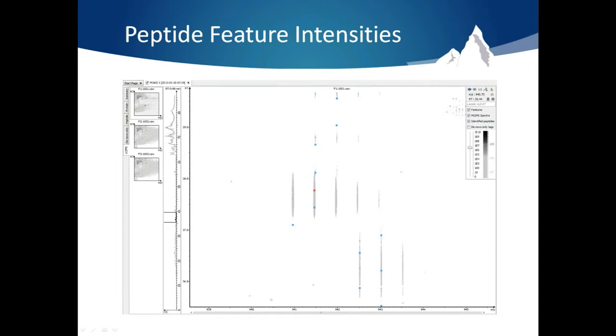It will bring you to the location in the LC-MS heat map where the MS-MS event occurred. This map gives you a top-down view of the signal coming out of the mass spec in terms of M over Z, retention time, and intensity.